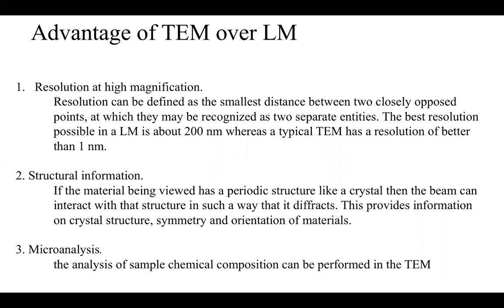Then what happens? This light wave starts to diffract. And when it diffracts, what happens? If it's just a point-like particle, this light will start generating diffraction rings around the particle. And if two particles are closely situated, they start generating these diffraction rings. Because of these diffraction rings, they start to overlap, and you won't be able to see two separated points, but what you see is blurred rings.